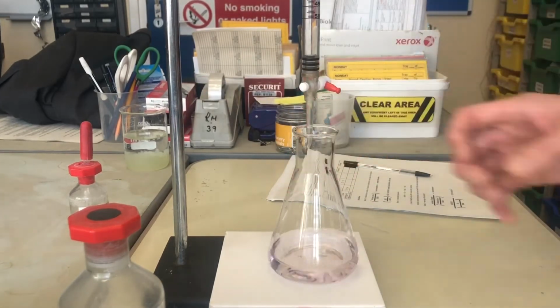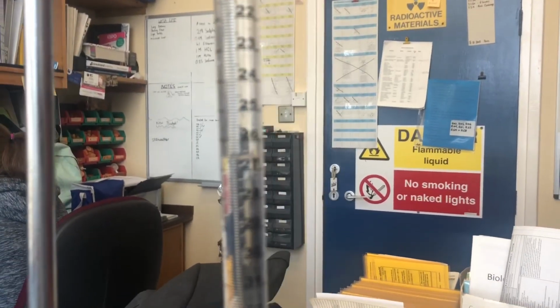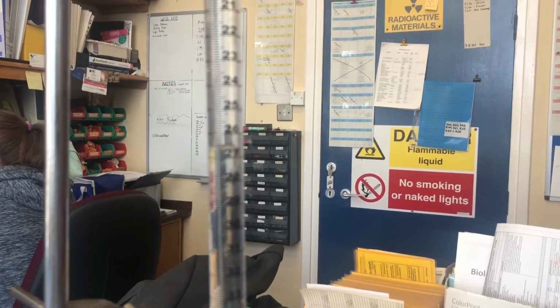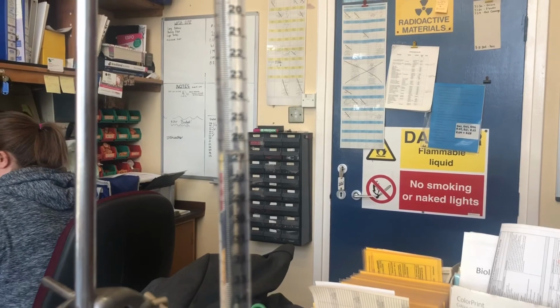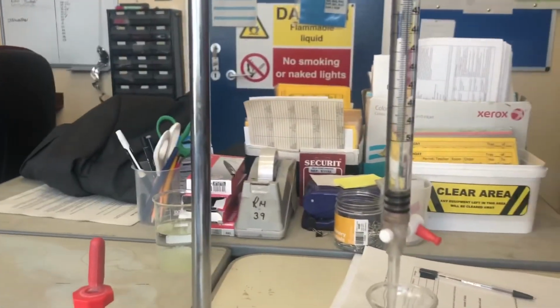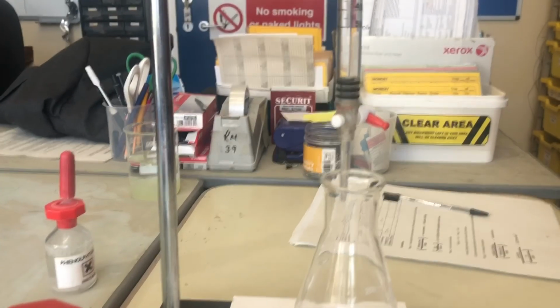So our neutralisation point, let's have a quick look on the burette. If we lift the camera up to see that. Should be able to see, hopefully if we can get a focus on that. Let's bring it a little bit further away. Just on the 26.6 line. It's not particularly well focused. But 26.6 is the neutralisation. Right, and that's how we titrate an acid against an alkali.